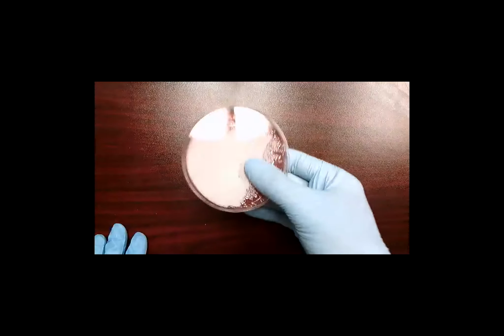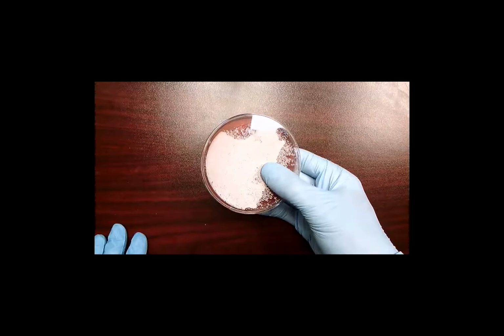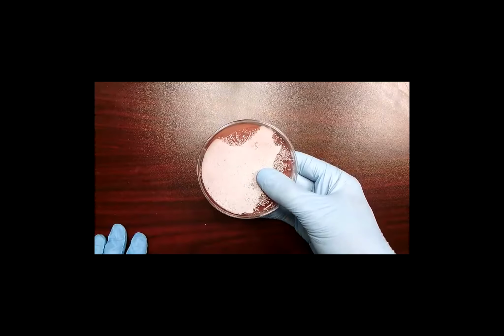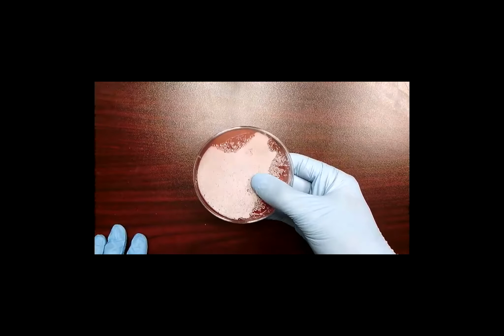Okay, so once they are plated, you want to incubate the bacteria at room temperature. It's important to note that you don't want to use an incubator or a heat lamp or any heat source like a heat pad, because it's going to promote bacteria growth that can harm humans, or the likelihood's more likely. So we want to avoid that in our classrooms and for our career development event.